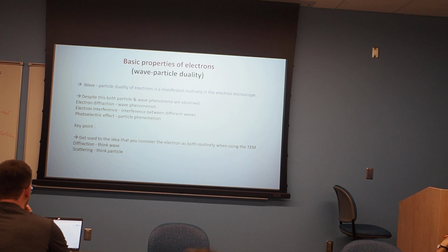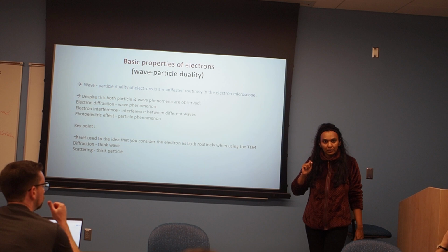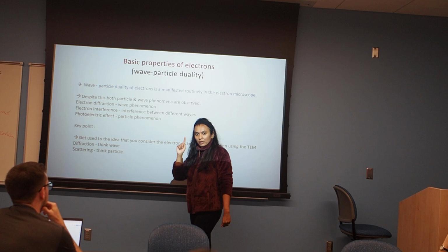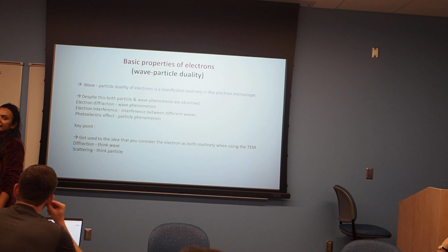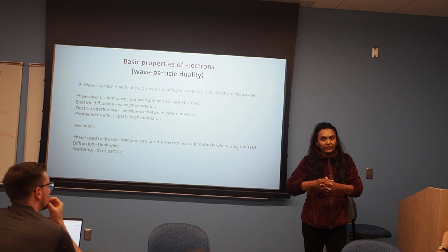Also, for a higher energy microscope, you have 1 million electron volt microscopes. That is 1000 kV. 1000 kV would mean we have 200 kV, 300 kV, and you go on and reach 1000 kV. That means something like 6 times more than what we have in UT. They are also available. They're a big, big tower. And they're available at facilities where they are really going subatomic level.